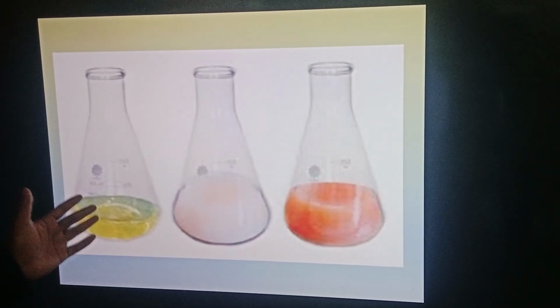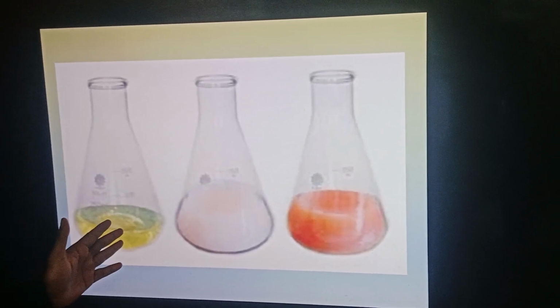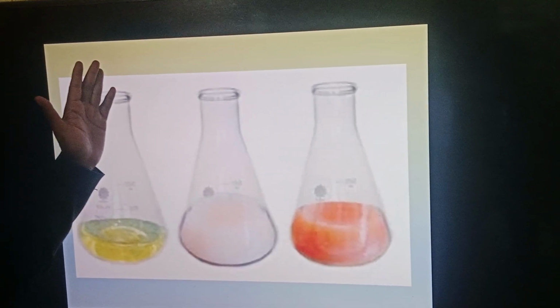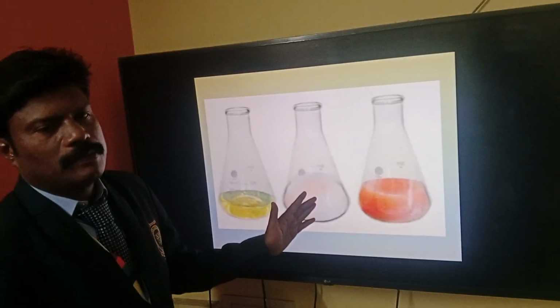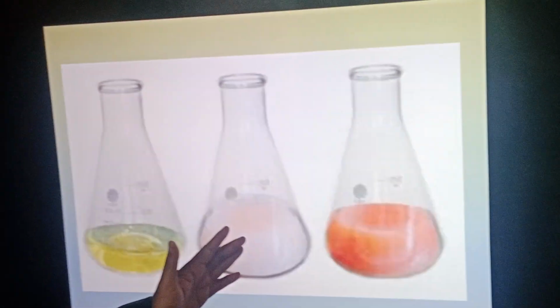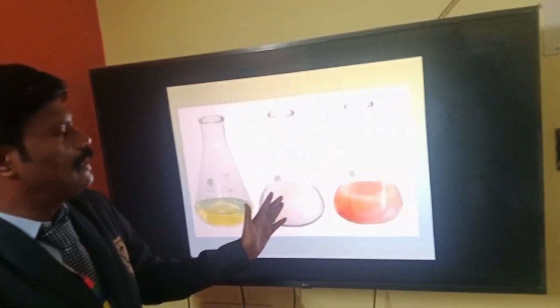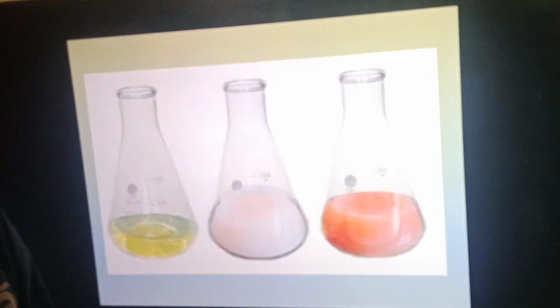This is the yellow color solution when we add indicator to the sodium chloride solution, which is treated against silver nitrate solution taken in the burette. It changes into a white colored mass, which is called silver chloride, which reacts with the potassium chromate indicator and is converted into a reddish brown color precipitate as the endpoint.